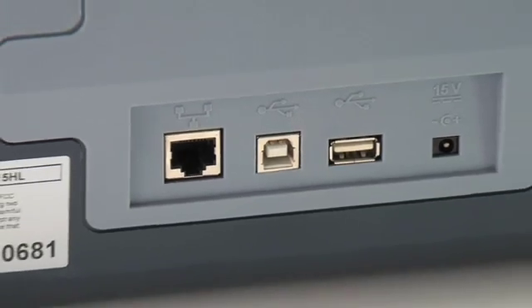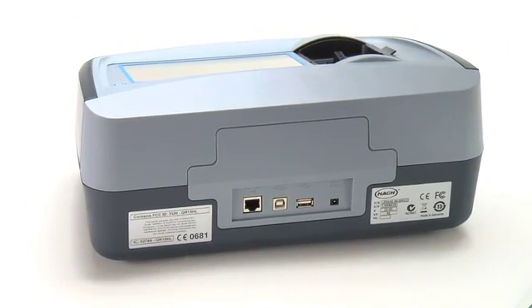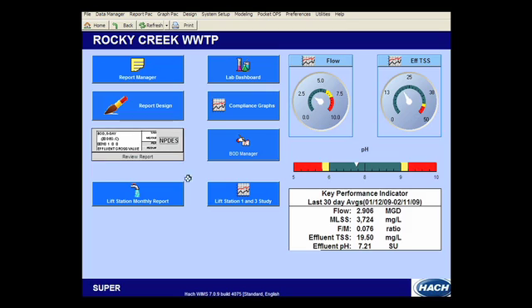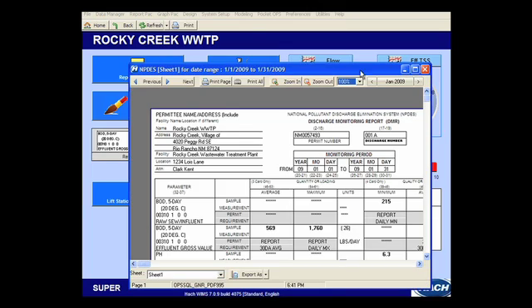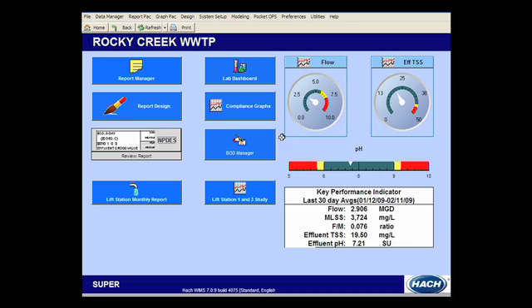Built with one LAN connection and three USB ports, connecting a spectrophotometer to your lab or field equipment has never been easier. The system comes equipped with software that allows easy connection between the machine and any Hock WIMS or LIMS system that you use. When connected, the DR3900 and Hock WIMS provide a seamless solution to data management.